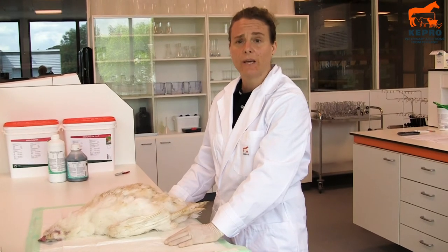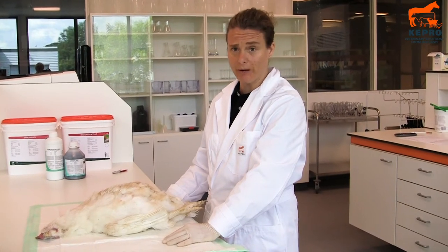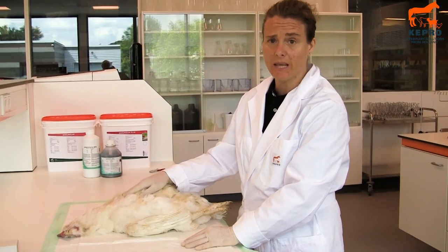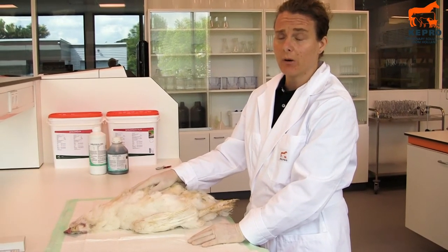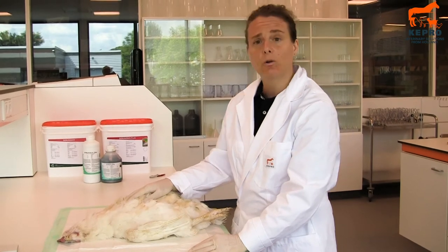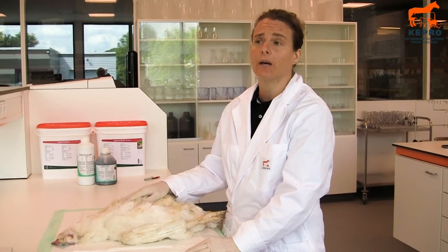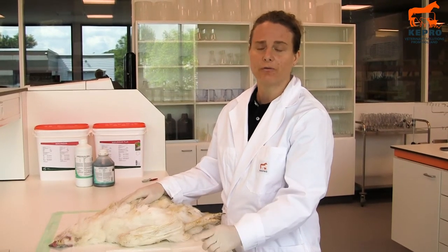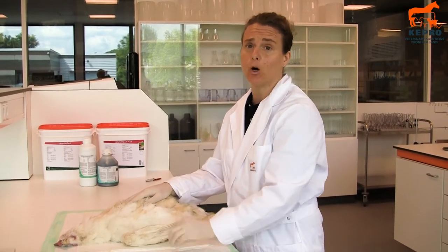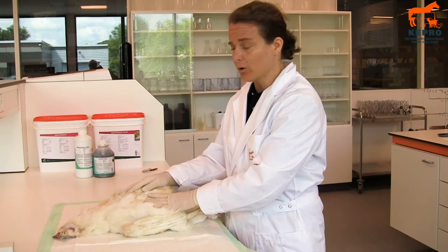This is Josje from Kepro. Today we are going to do a post-mortem examination on a broiler breeder parent. They have been laying for about a year and nowadays they are changing the feathers so they can take another round. We are going to do a post-mortem to see the difference in gut health and also to see the difference between a bird which is already dead and a freshly opened bird. This bird died about 15 minutes ago and now we are going to dissect it.